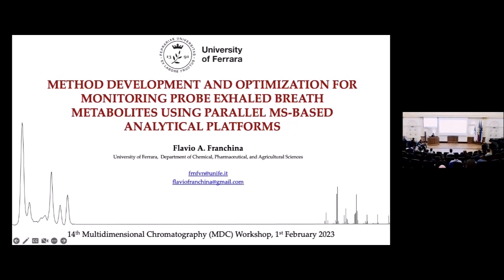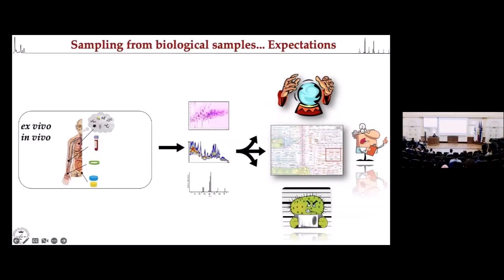So today I'm going to share with you some considerations, some experiments we did for method development and optimization related to breath analysis, in particular for monitoring some probe target analytes. Of course, involving GC×GC and MS-based detection.